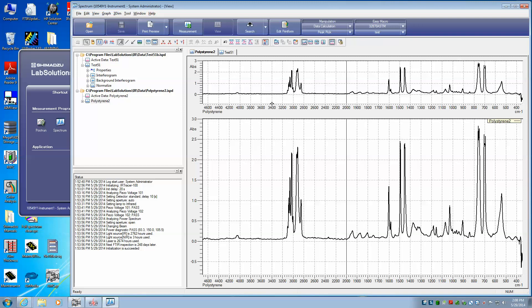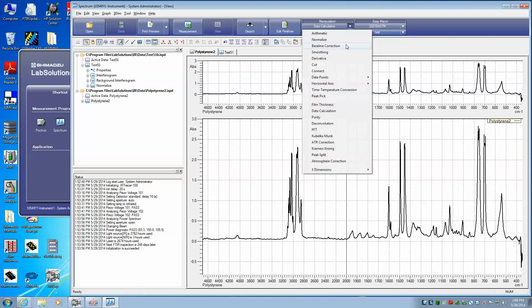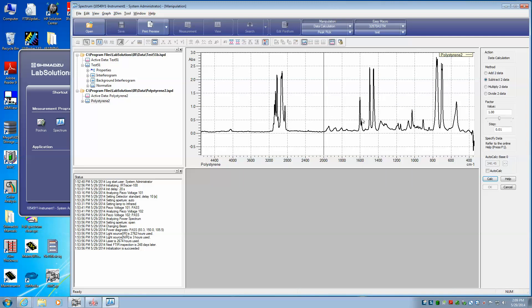Say now we want to actually subtract the two files. We want to subtract our saved file from our test file. So up here, under these two icons, we have all the manipulations that are possible. I'm going to select here Data Calculation. And in Data Calculation we get this new screen, and on the right here I'm going to say I want to subtract the two data sets.